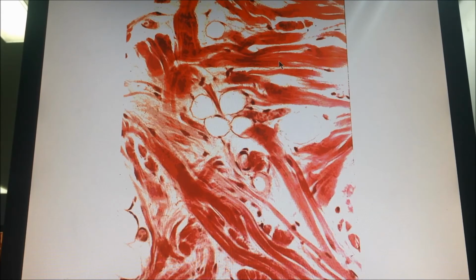In dense you have two choices. It's either dense regular or dense irregular. هذا irregular طبعا. The collagen bundles are not parallel. They are in all directions. Where can you find the dense irregular connective tissue? Common sense, you see it in the dermis of the skin. This tissue can resist tension from all directions, and you need this in the skin. Also, you can find it in the capsules that surround the organs and the joints; برضه بيكون dense irregular connective tissue.